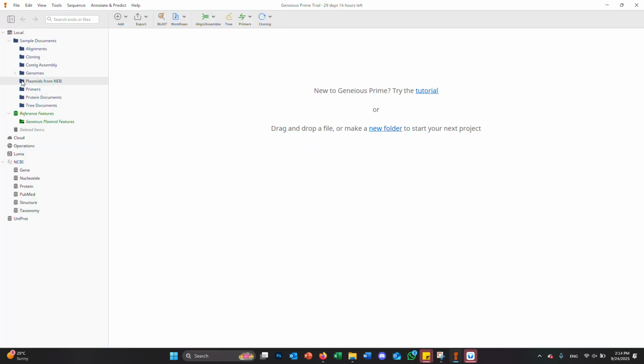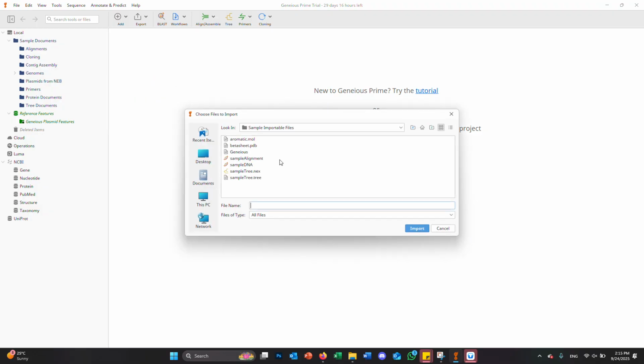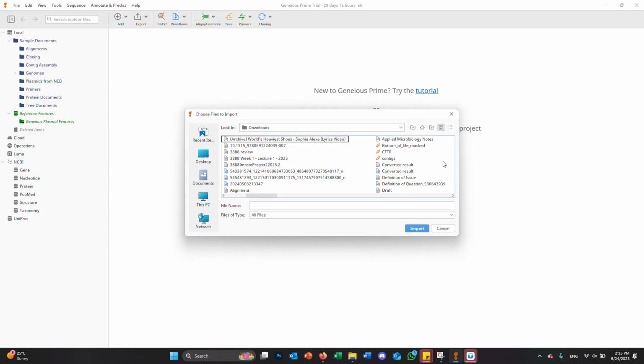And so this is just spitting out information. Our run was 42 hours. We got over 12 gigabases of data and 18 million reads. Our N50 was 1.19. I'll talk about that in a couple of slides, what N50 is. You probably already have heard that term before. We also have a lot of other charts. I'll just show you this one here.